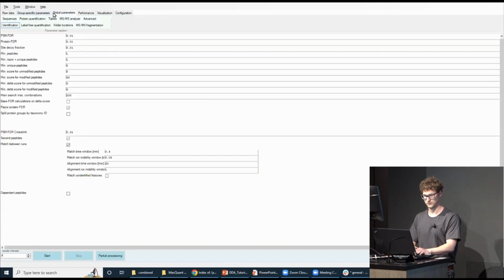Now, this is all for SILAC data. Any questions? Okay.